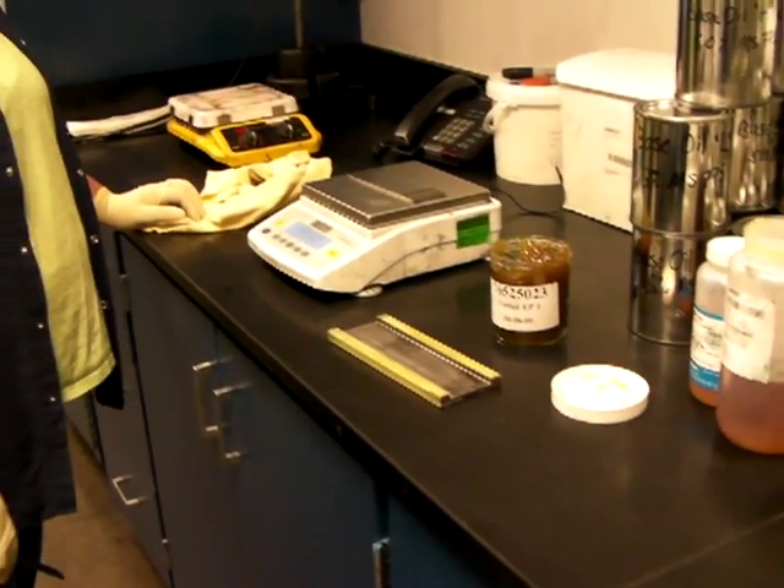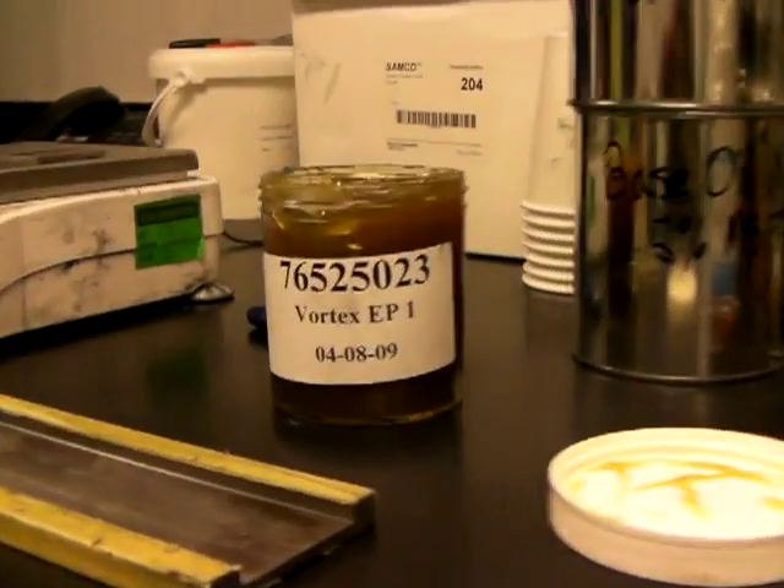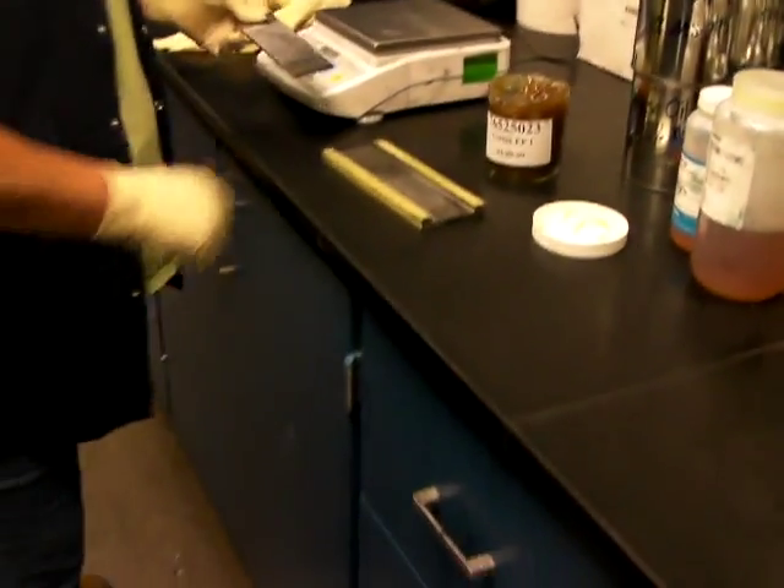We're recording now. We're going to record Carmen doing the water spray off test on Vortex Grease. She's already weighed the panel.